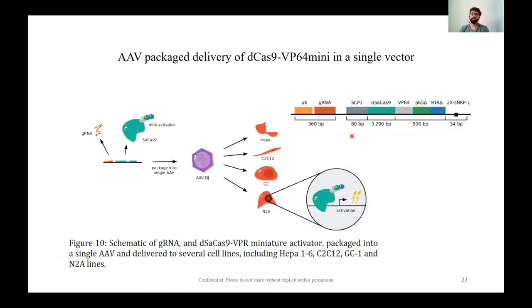There are other methods as well, which basically incorporate this entire thing in one polycistronic gene region, such that you express all of these factors in one. And this current version is basically lower in size. We'll talk about it later as well, why the size of your delivery vector would influence the efficiency of editing. Because in primary cells, it is really difficult to get huge bulky vectors in. Compared to the size of the previous version, 10 KB, this is a truncated version, right? Around 5 KB, so easier to get inside the primary cells as well.